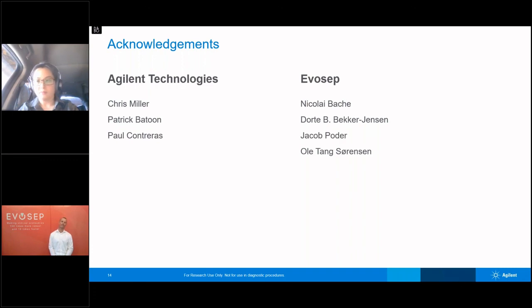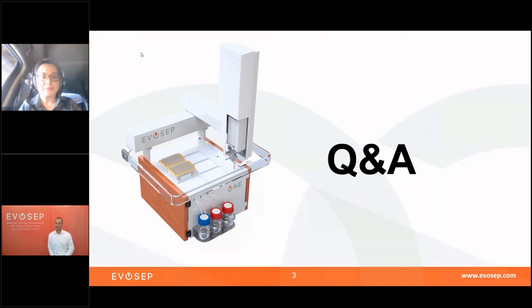Thank you very much, Linfeng, for a very nice presentation. I really think that, to me, the most exciting piece of data, although everything is exciting, was really how well the samples stored on the Evotip. It's one of these things that we have been arguing. We have bits and pieces of data, but at the time, this was the best quantitative data set that we have ever had on how well peptides are stored on Evotips. There's a lot of other really nice observations, but to me, that was something that I've been looking for a long time.